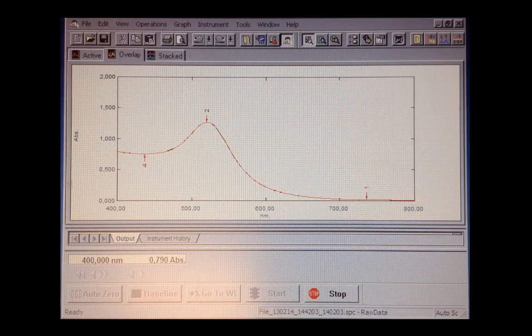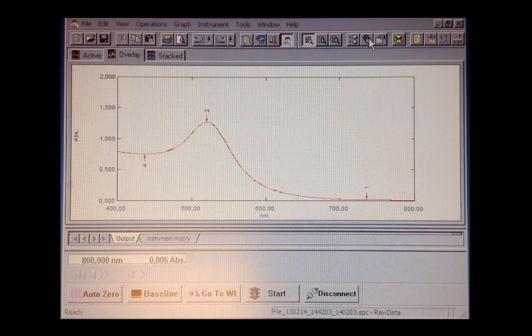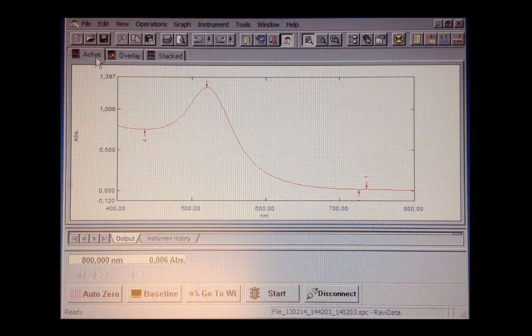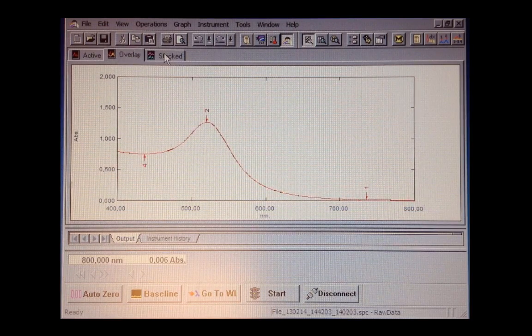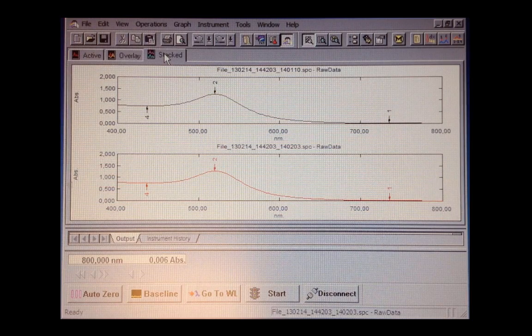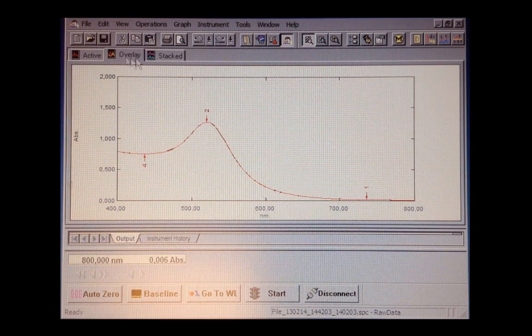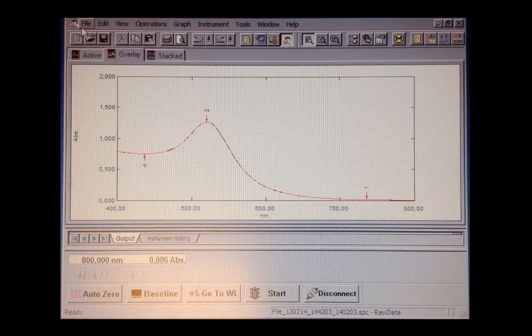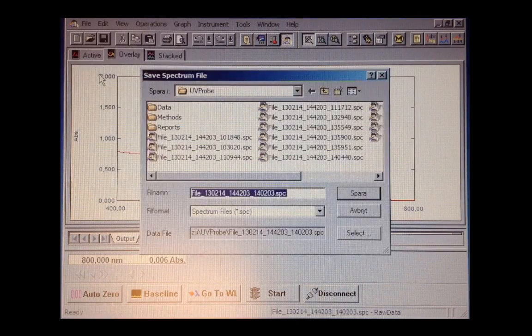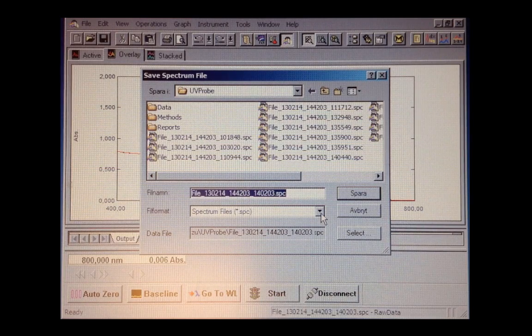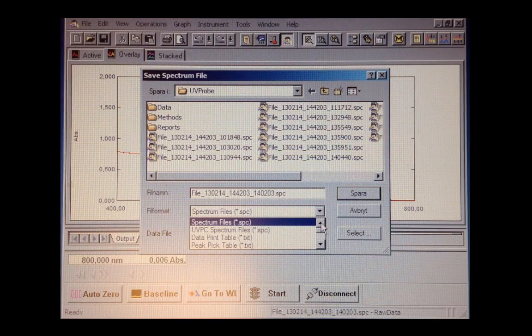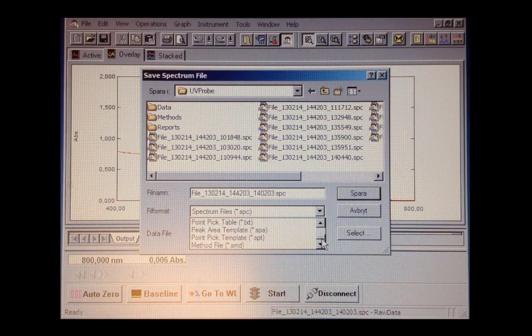You can do a second scan, of course. In this interface, there are three buttons: Active, Overlay, and Stacked. In Stacked mode, the scans will be shown separately. You can save your files in different formats so that you can handle it with different methods or different software.